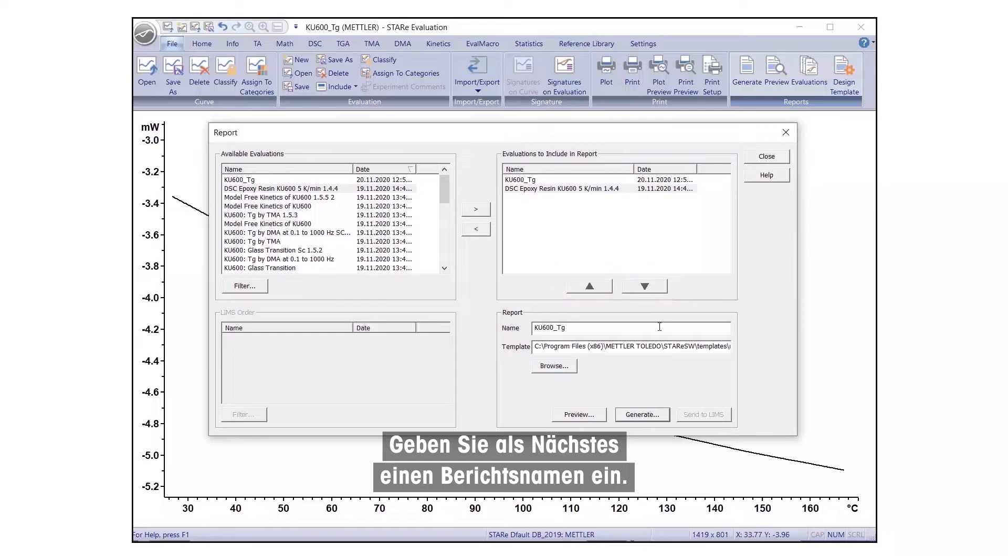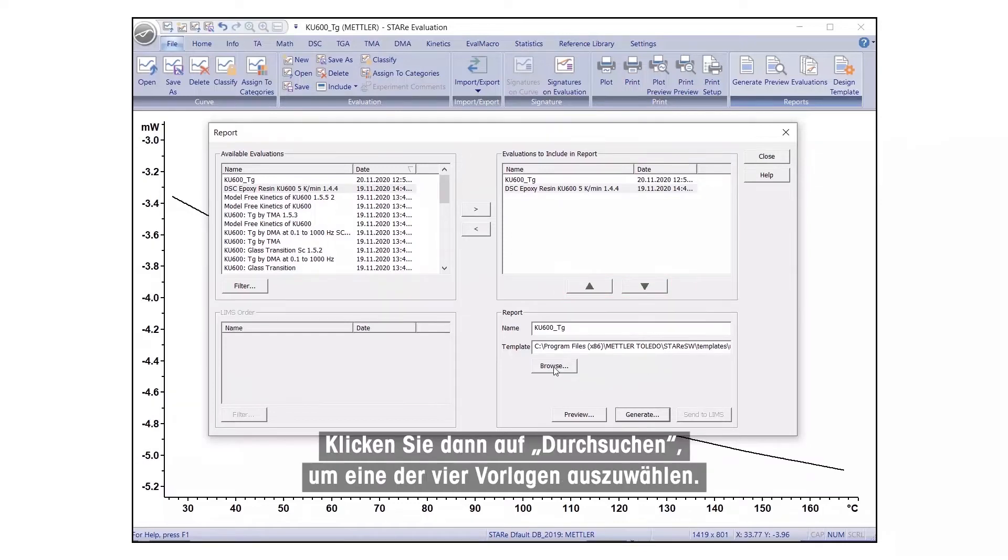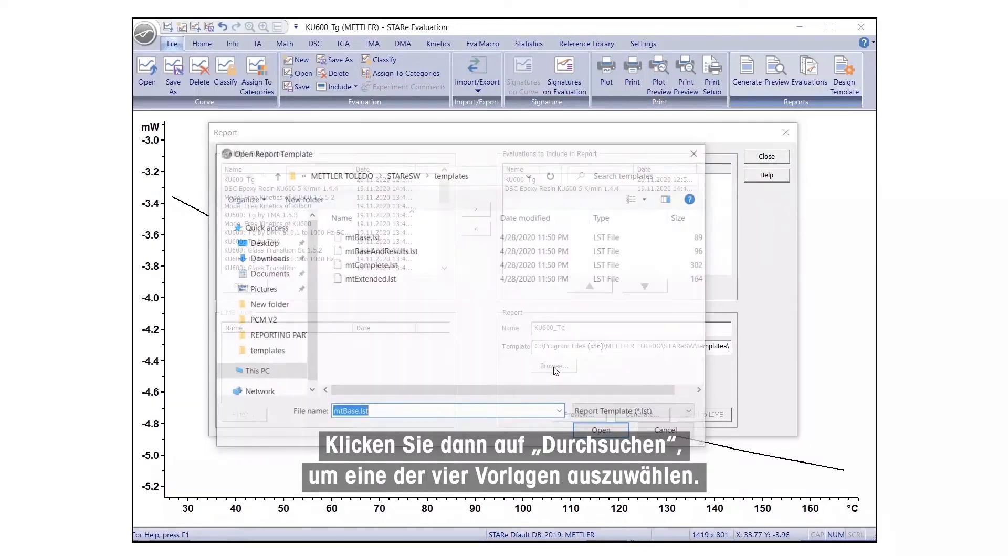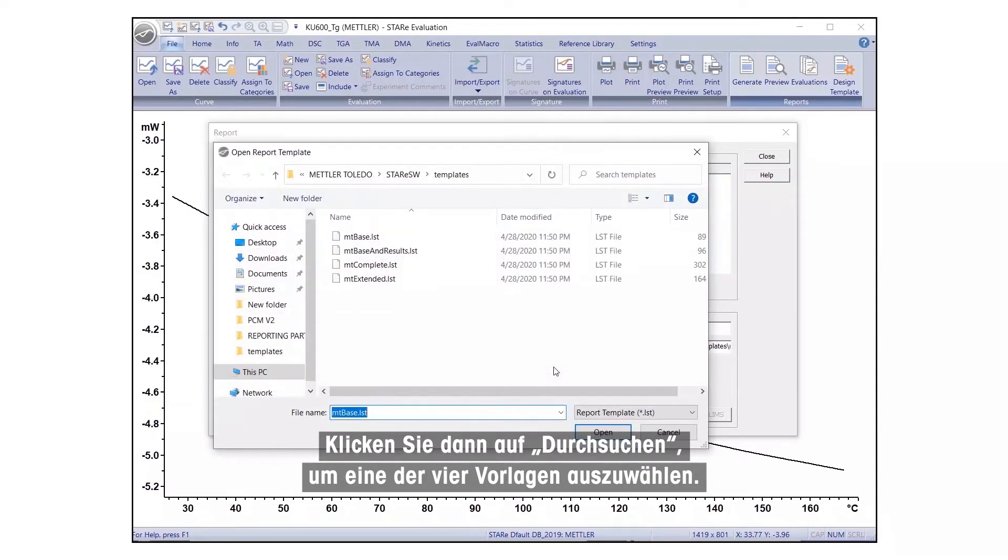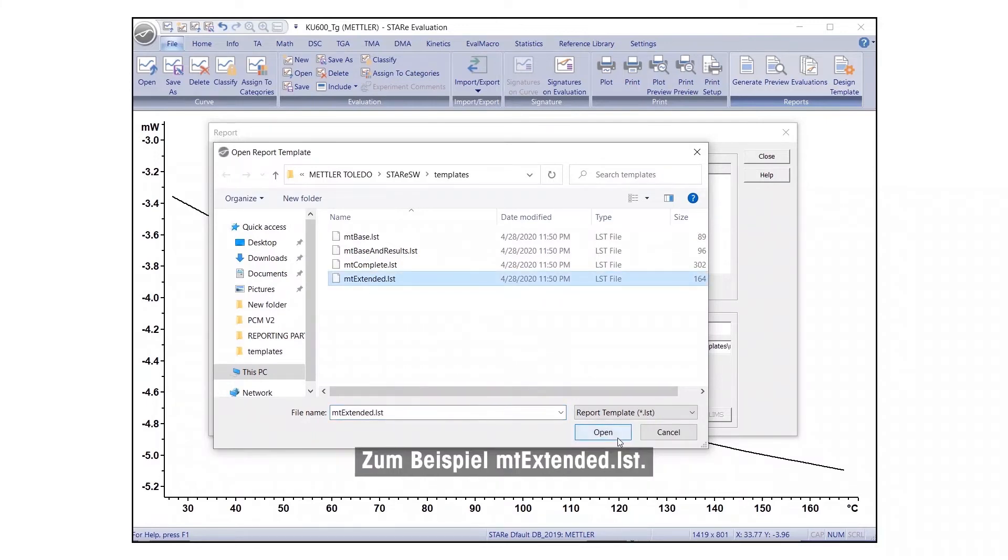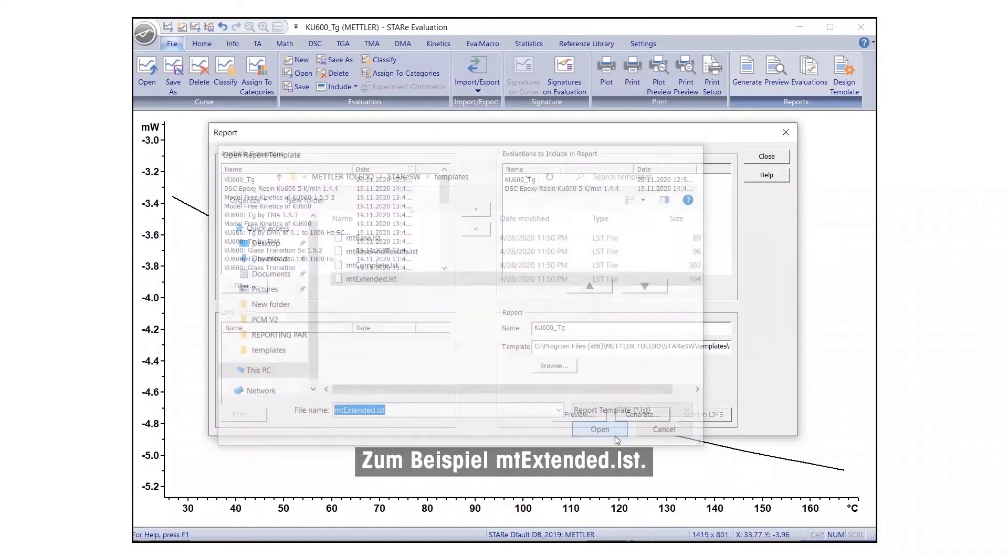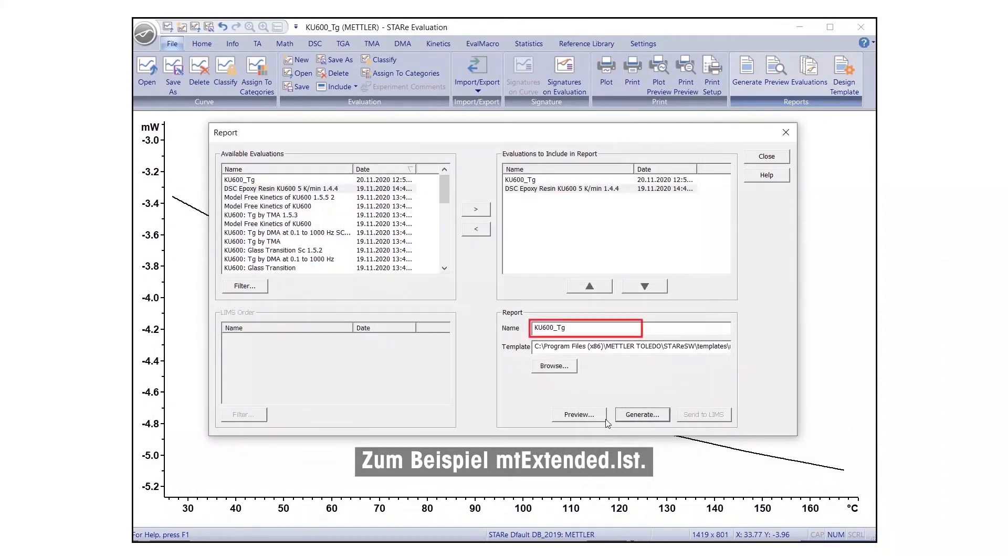Next, enter a report name, then click Browse to select one of the four templates. For example, MT-Extended.LST.